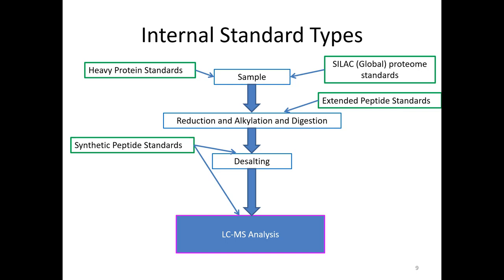Could take it all the way to amino acids and do amino acid analysis. Right, so some people use amino acid analysis. In amino acid analysis, you take your sample with a fixed volume and you hydrolyze it with strong acid like hydrochloric acid, and it breaks up all of the amino acids individually. And then you look at that in comparison to a standard, either using fluorescence, it's always chromatography based, sometimes CE. And then you base the concentration of what you've measured to some external standard.